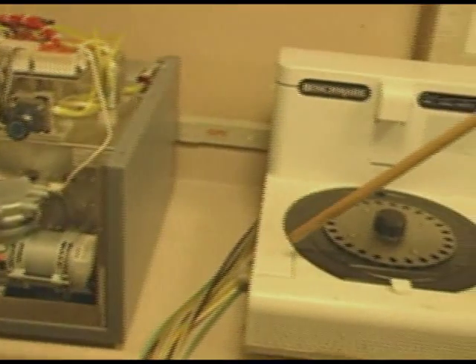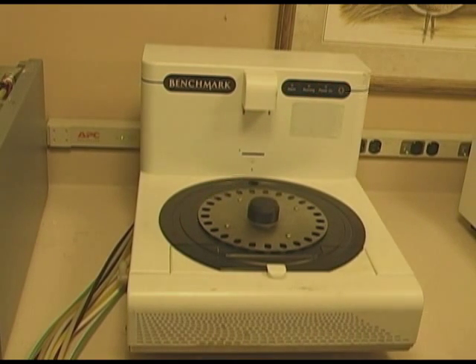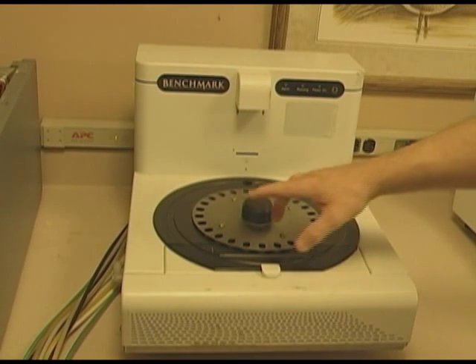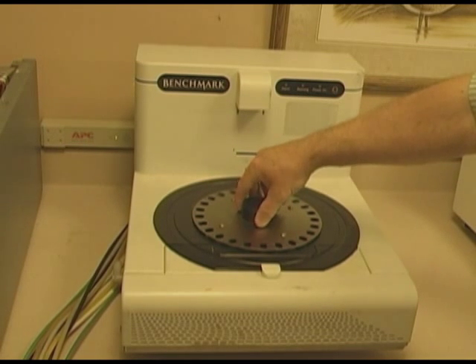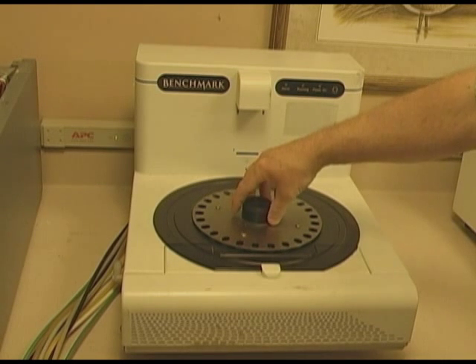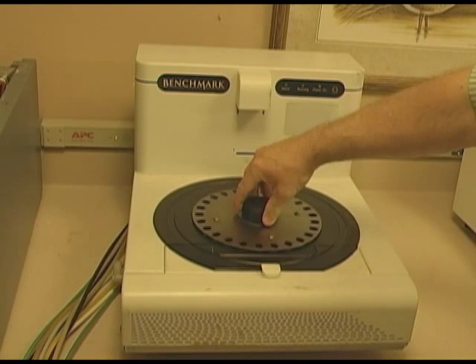On top of that sets the slide stain module. On top of here sets a big holder for the reagents. There are two different drive motors — both motors go to a belt and it drives your reagents around in a circle.